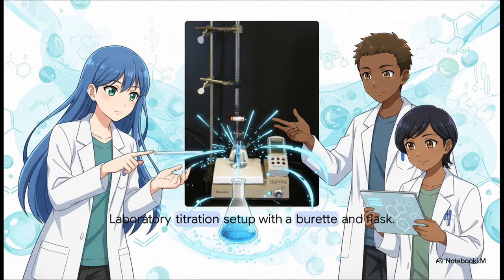Check out this brilliant laboratory titration setup. See that tall, graduated glass tube clamped to the stand? That's the burette. For Dr. Chem's experiment, this burette is carefully filled all the way to the 0 mark with our standardized EDTA solution. Directly below it is the conical flask containing our water sample, resting on a stir plate to ensure continuous, even mixing. This vertical setup is absolutely crucial because it allows us to add the EDTA drop by drop into the sample with undeniable precision.